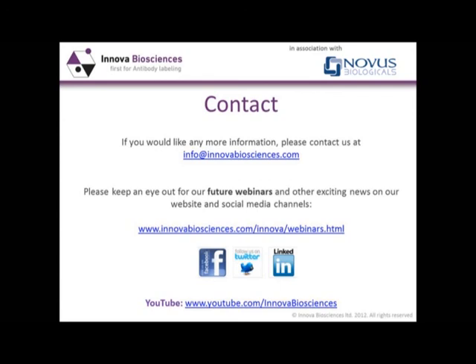What you have more control over is trying to reduce non-specific binding, and that can be done by blocking the Fc receptors, either using monoclonal antibodies, or blocking with irrelevant immunoglobulins, or indeed just having protein in your staining solution, BSA or fetal calf serum. That will reduce the non-specific binding of your antibody. But it does highlight the need to have your appropriate controls in so that you're aware of what level of non-specific binding you have in your system.